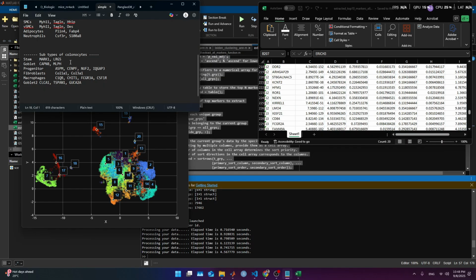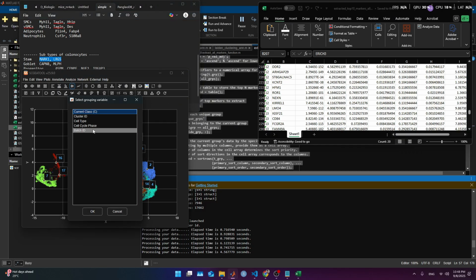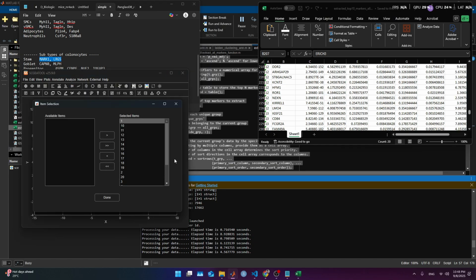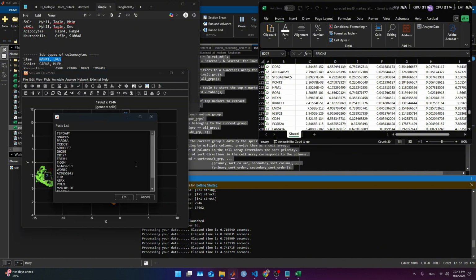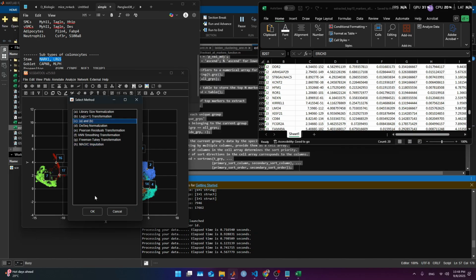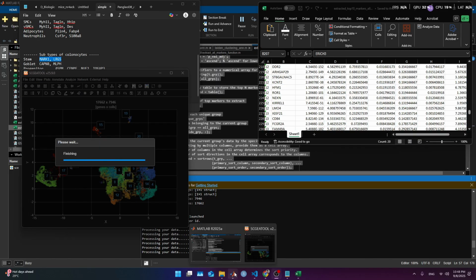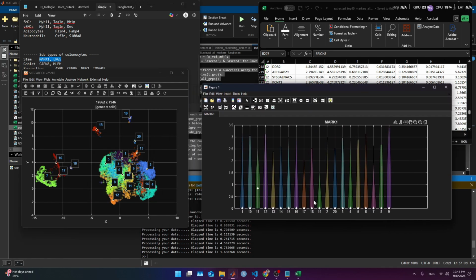And again, let's look for stem cells. And we're going to do the Violin plots for all the clusters again. Done, expression, paste. And here I'm going to do something I haven't shown you. I'm going to go for the specific stem cell markers.